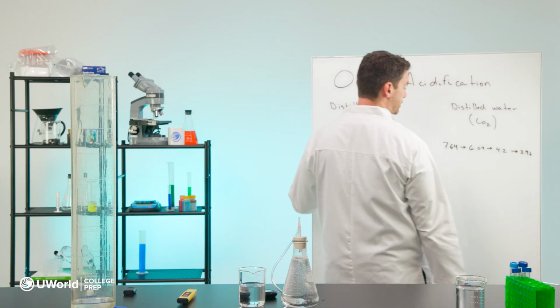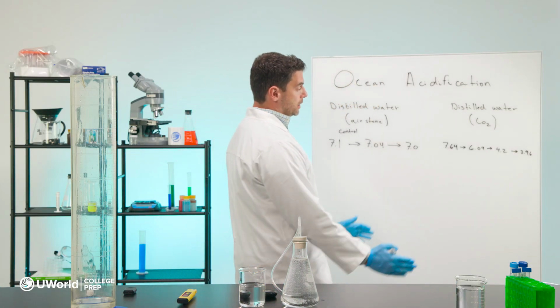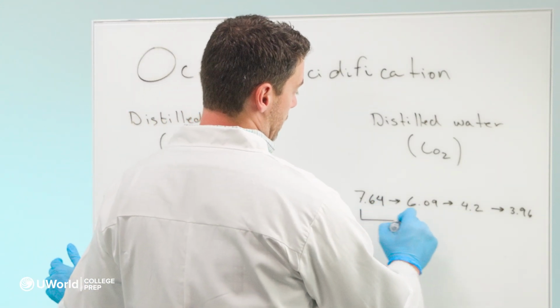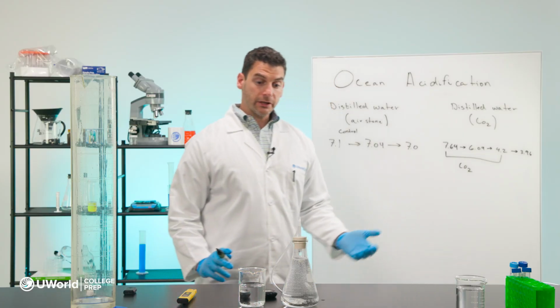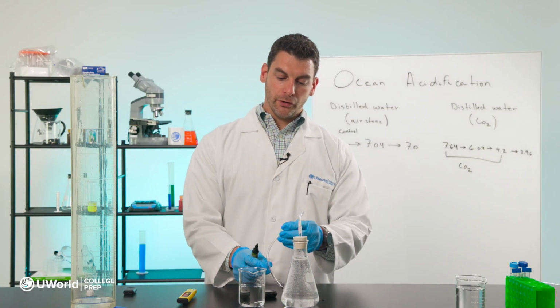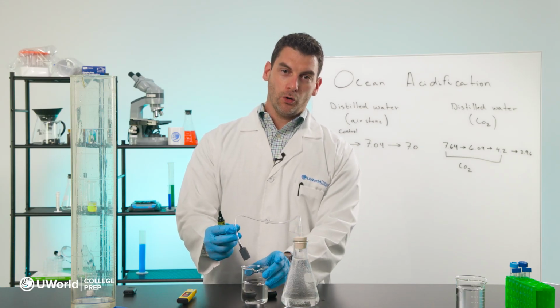So after we took the air stone out, there really was not a huge change. But you can see how much of a change we had with our effervescence. And this change was due to the production of CO2. And similarly to our oceans, that CO2 that's produced in here is transferred through the tubing, kind of like the atmosphere, and then is exchanged with our water.